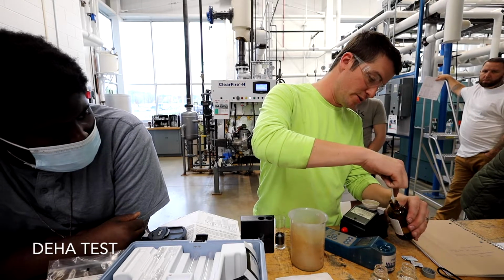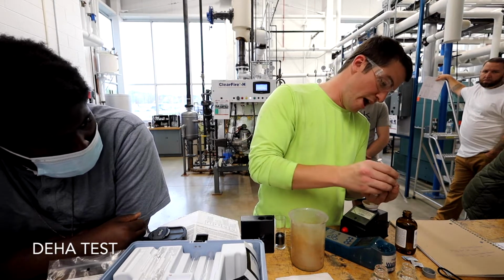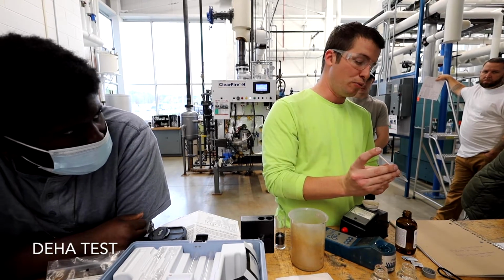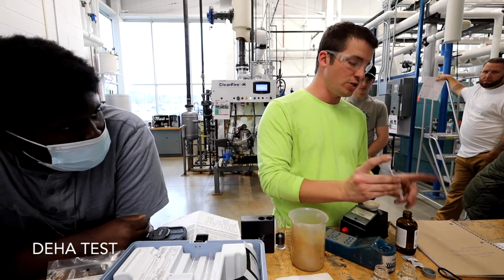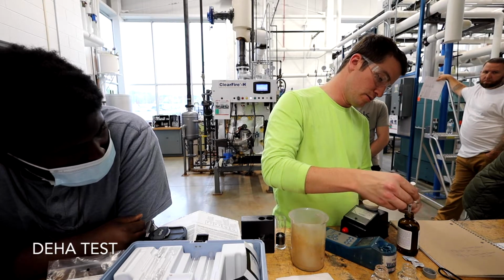Now here's the key, right? Typically when you do this, there's always a little air bubble. So right now, we have to take that into account. If I'm adding ½ ml, I always fill it to 0.6 and then I push it down to 0.1. And then I eliminate caring about that air bubble. Otherwise, you just gotta make sure you empty it out and then suck up and don't get an air bubble, which can be tricky sometimes.